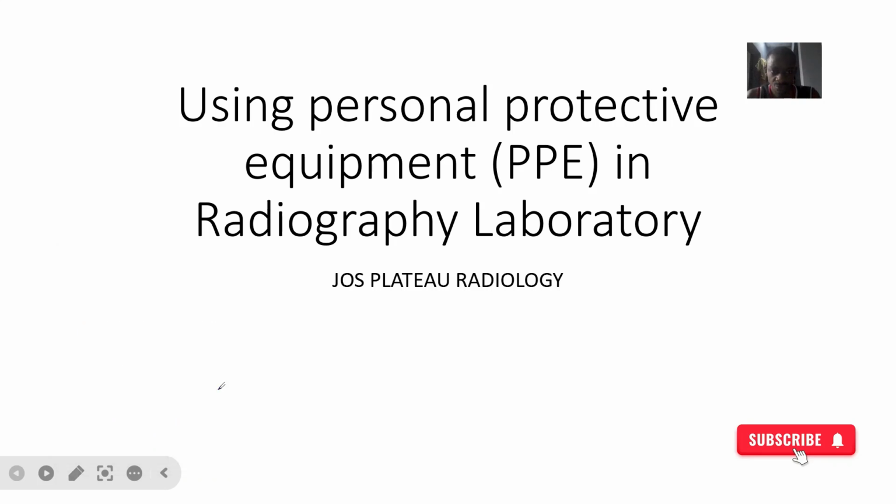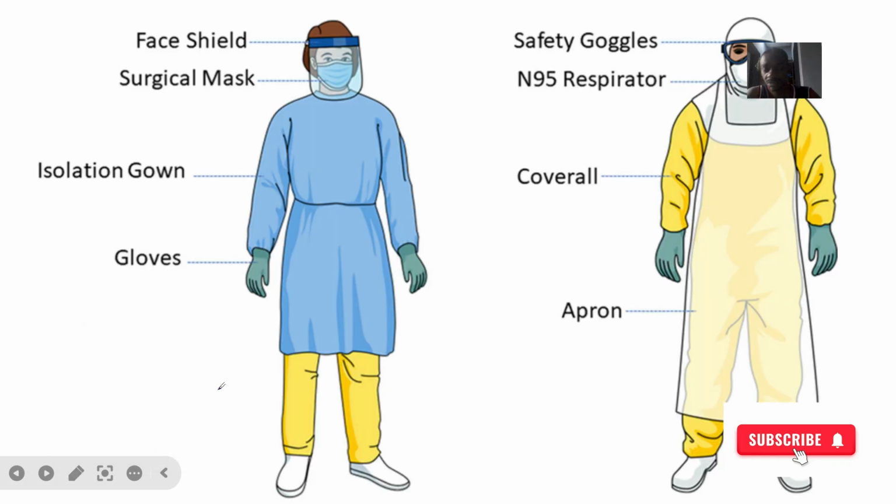So what we got is this. This is what a PPE is, and it has to do with the overall protection you get when you are in the lab, protecting all your body parts and all of that.